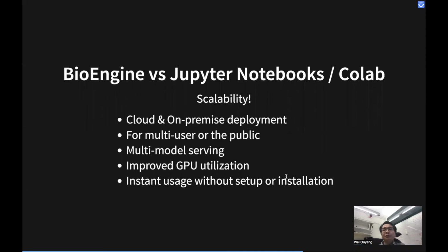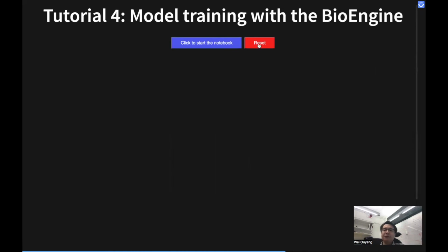So those are the tutorials. I hope you at least get an idea of how it works, and feel free to play with these notebooks while listening to this tutorial. Feel free to make changes. You can reset if you mess up the code, but be careful, because it will remove everything you changed.